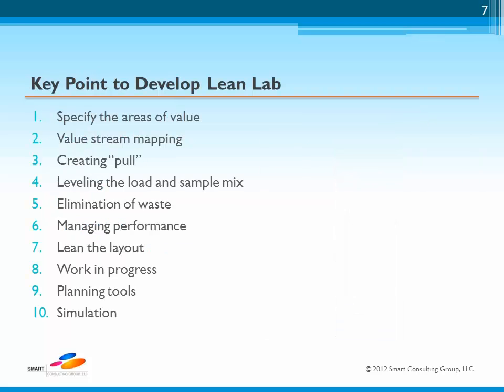Okay, so we've identified some of the causes of laboratories being problematic and generally ineffective. So if these are now crystallized in terms of lean operating principles, a basis is developed to create a meaningful forward strategy based upon a lean philosophy. To recap, some of the key points previously discussed, together with those following on below, we can see that all the structural elements are in place for the development of a lean strategy for the laboratory.